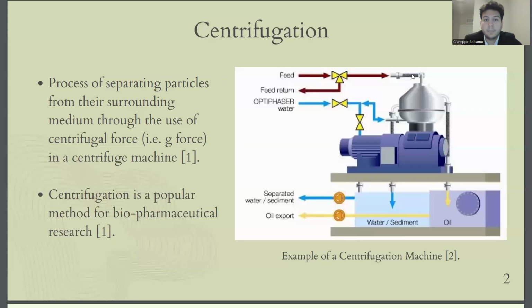Centrifugation. So, what is centrifugation? Centrifugation is a process by which particles are separated from their surrounding mediums through the use of centrifugal forces, or G-forces. This is usually done through the use of a centrifuge machine. Centrifugation is also a popular process used during biopharmaceutical research.